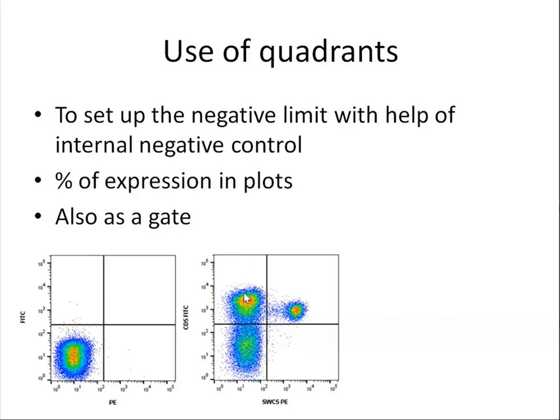During analysis, I'll show you how to check the percentage. Someone has to remind me during analysis: I have to tell you about the quadrants and percentage, and also show you the logical scale adjustments. So please remember, and if I forget, please remind me.